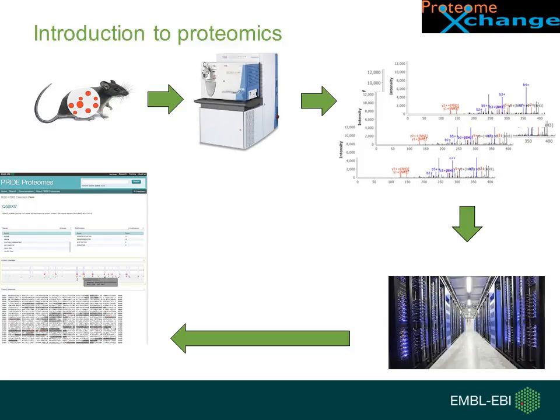You can see the sequence, you can see which peptides, which parts of the protein sequence have been observed, also in this overview diagram, and then which modifications have been observed, and also in the summary, because this integrates over many different samples. It says then in which samples this protein has been observed.